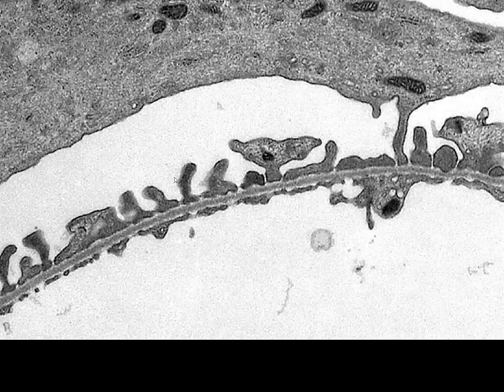So, a little higher magnification. Again, we can see the openings here, the fenestrated pores, but these are going to have these little membranes across them. Can't really see them so well in this particular image.